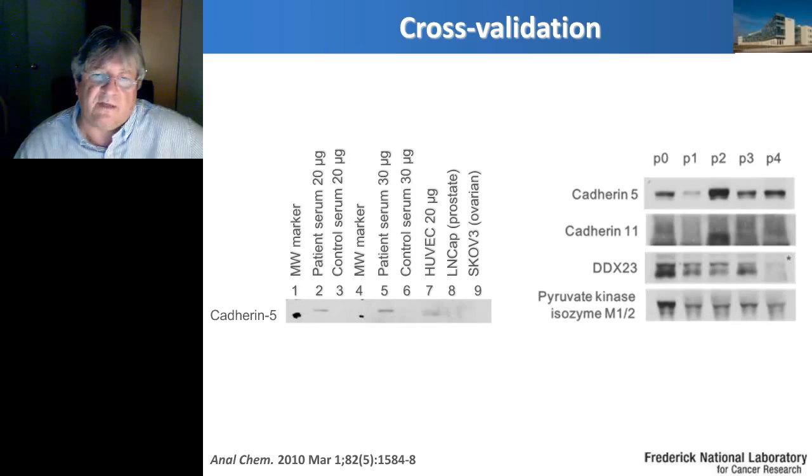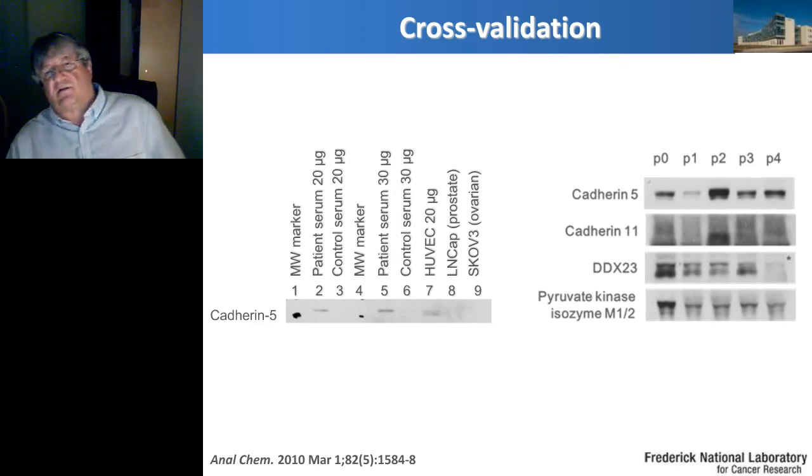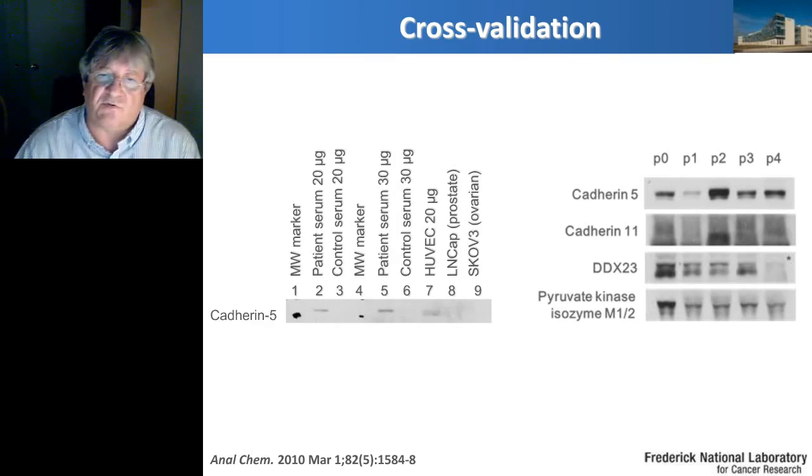And we have taken peripheral blood of 4 patients, and we did Western blot of serum. This is our initial patient, and the other 4 patients, and out of those 8 proteins that we have shown before, 4 we were able to prove that they are found in a patient diagnosed with renal cell carcinoma. Those sera we got from Dr. Linehan from NIH.